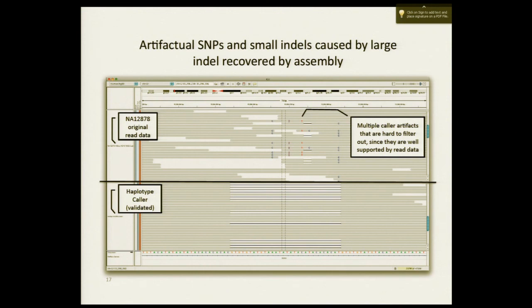And so right here you have ACA, TCT, I don't know. So somehow when you shift all of this stuff over to here, it matches up with the reference, right?